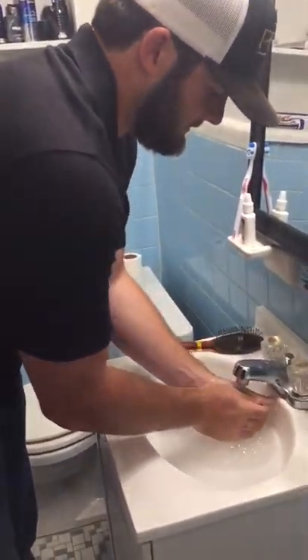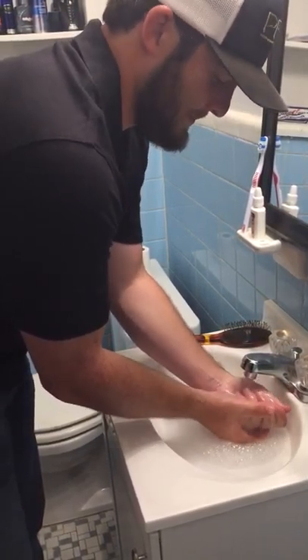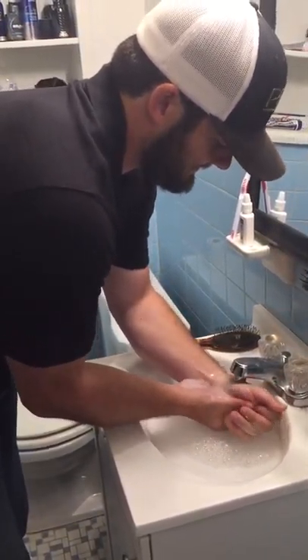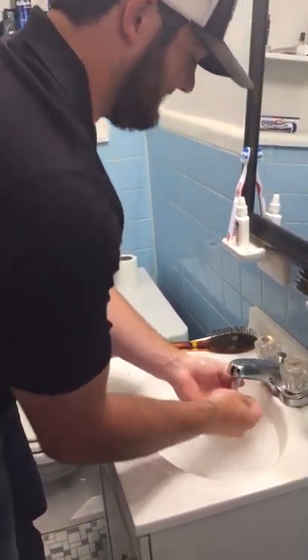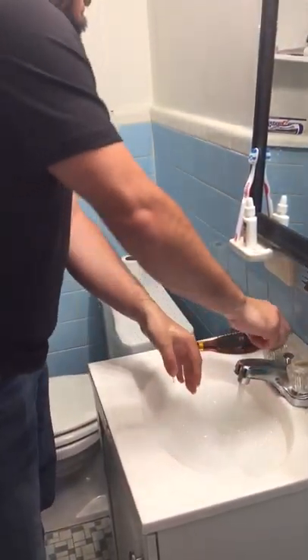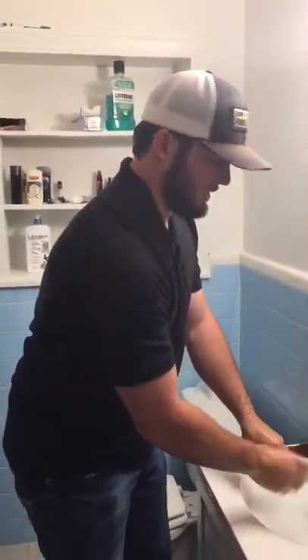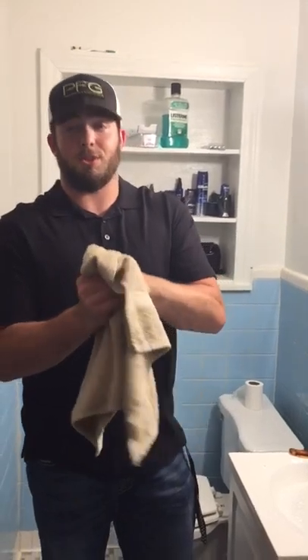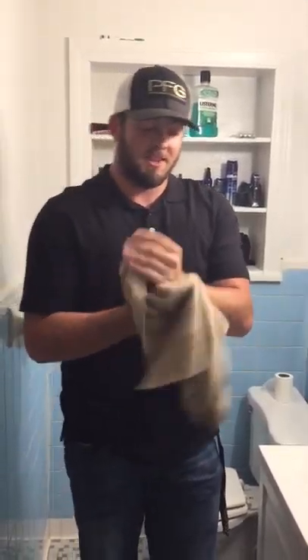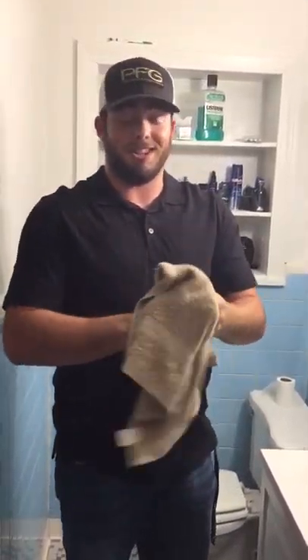Make sure to get all parts of your hands, of course. Then you rinse off with warm water. Then you need to dry your hands very good. This way it makes it easier when putting on your latex gloves.